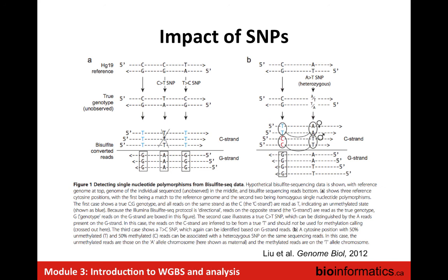So you don't have information on the strand anymore, but you do have the two types. So you're looking at a particular location to make sure that you have two types of reads. But you don't know originally which one came from which strand, which is why you have to do everything in parallel, assuming that you don't know that information.